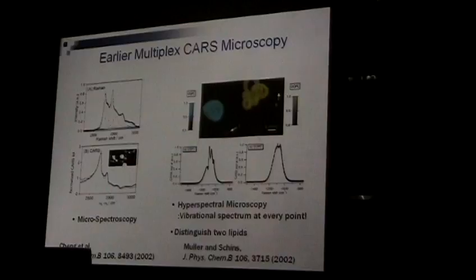This one is actually from the Sun and Shi group, who did all the work I showed yesterday. They didn't bother to do microscopy. What they did was scan their lipid sample like this, look at this one and just take one spectrum. And then they showed you can do it. And this is the problem I had been talking about yesterday.